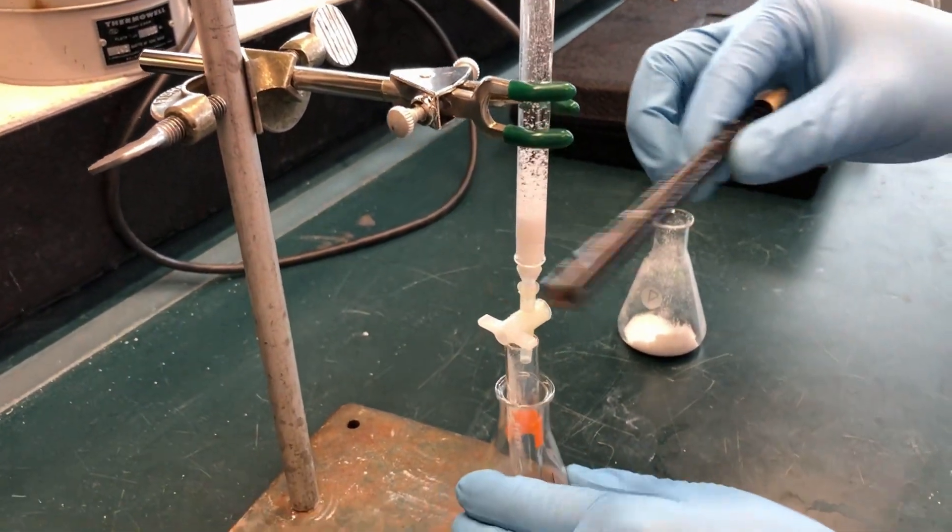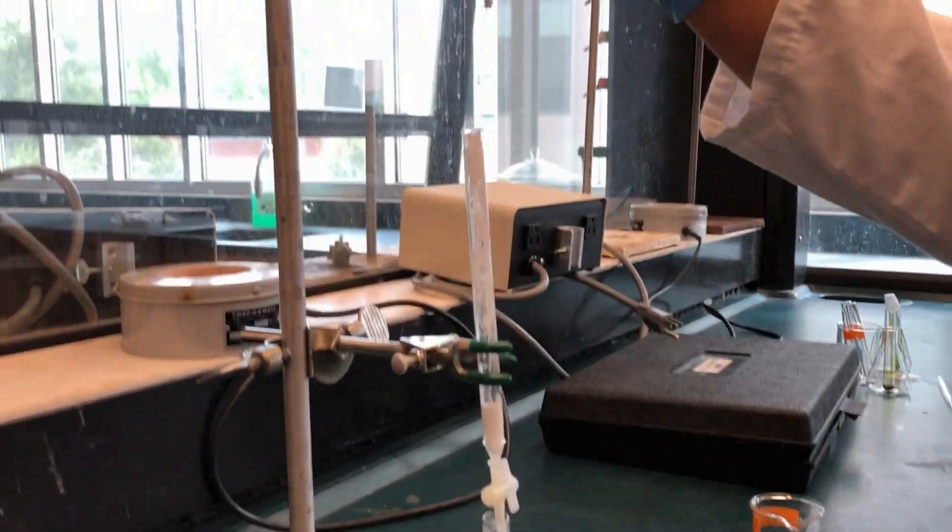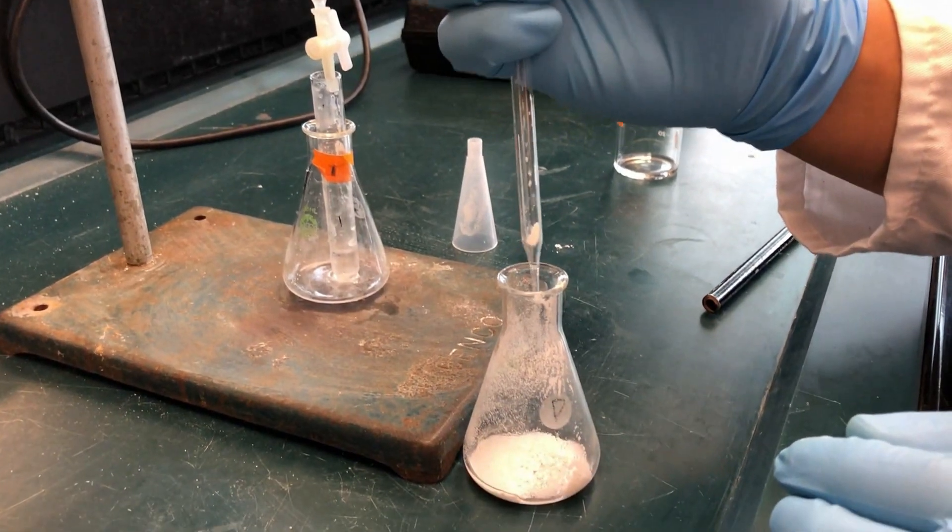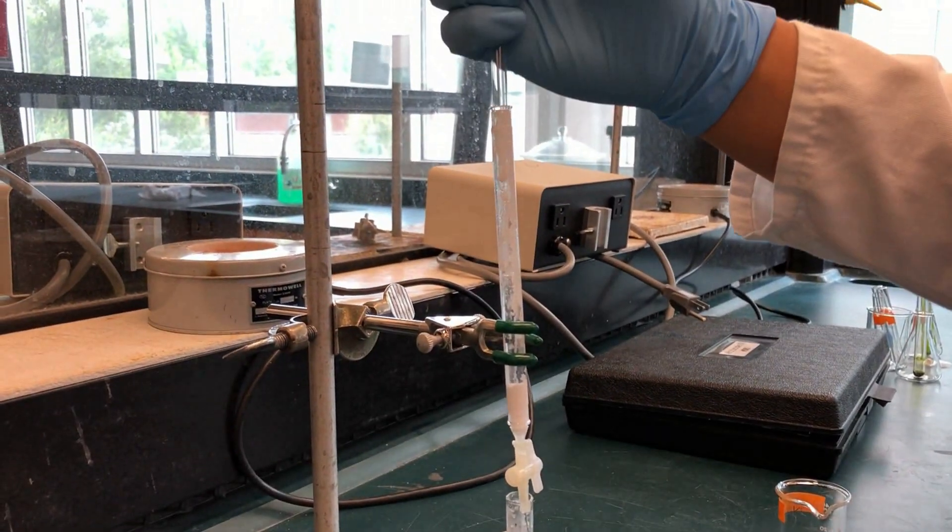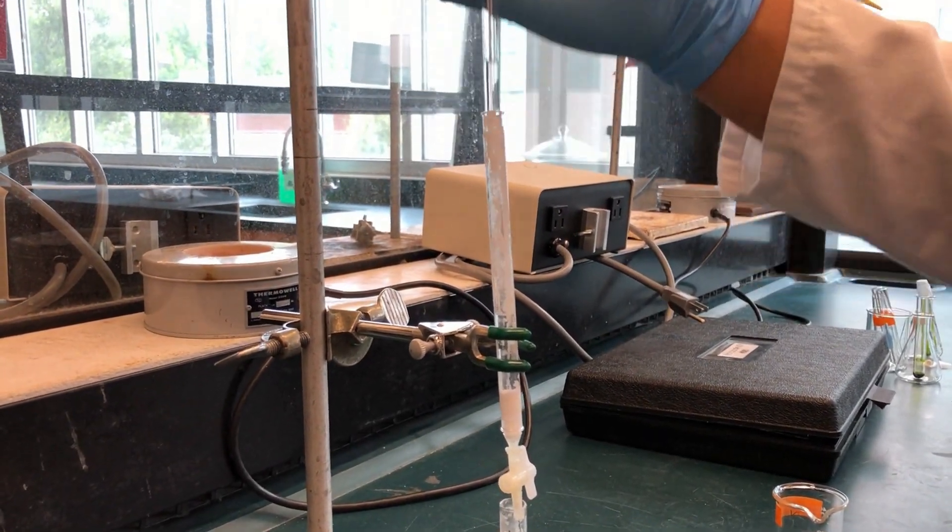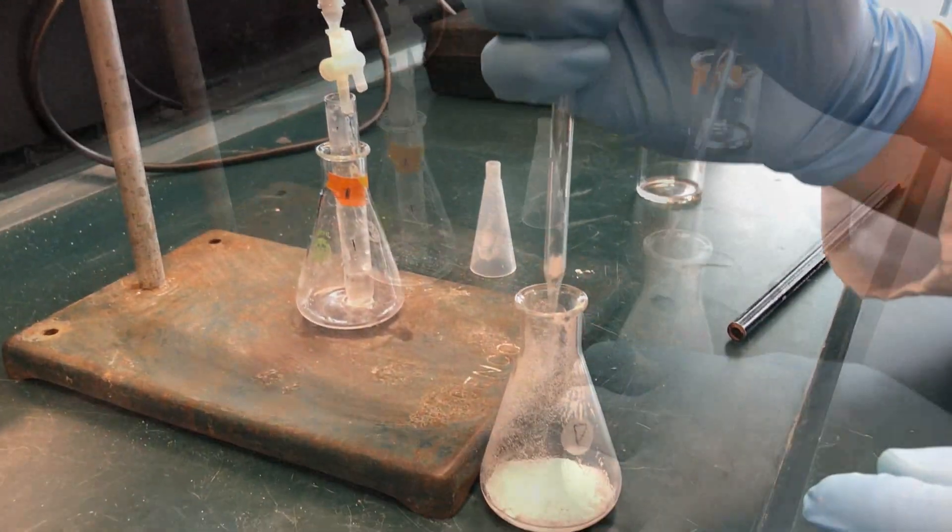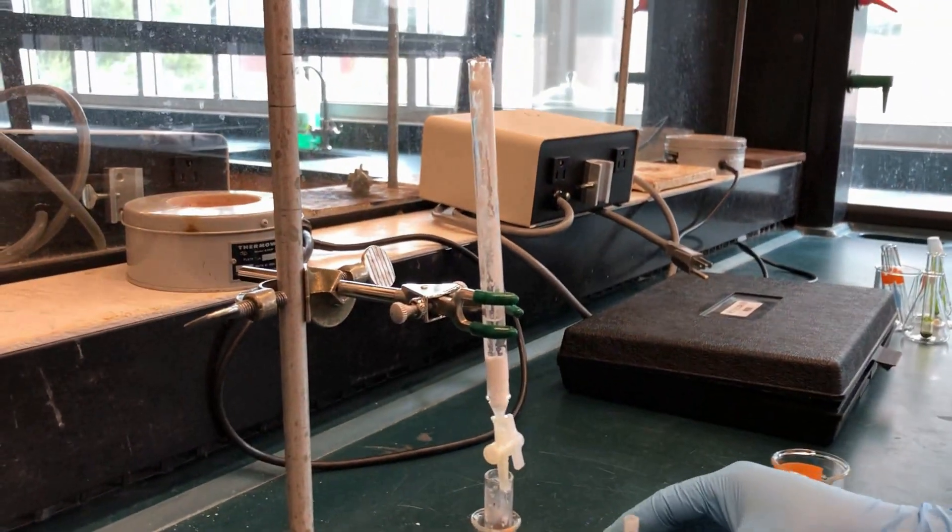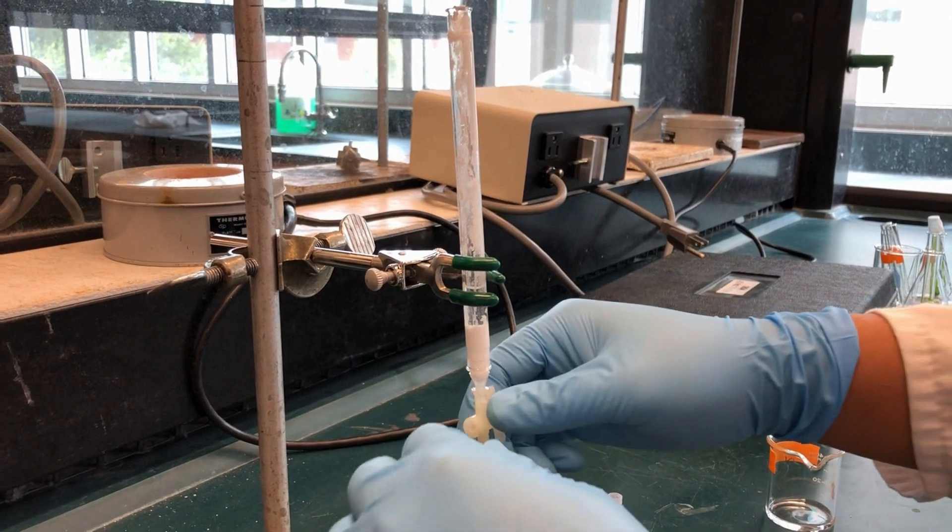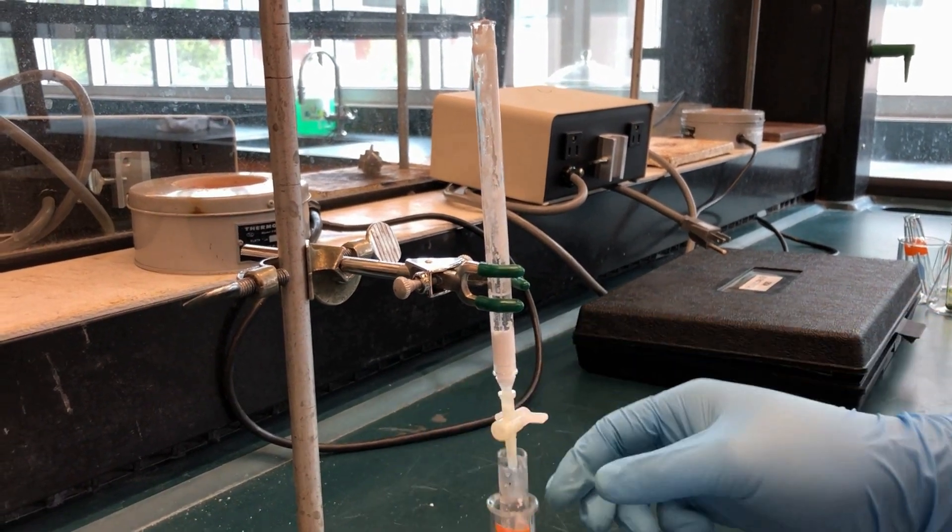Lightly tap the column with a pencil to help the alumina settle and avoid cracking. If the collection is slow, you can pipette the excess petroleum ether from the column to be reused to mix the alumina in the flask. Be careful not to pipette the settled alumina. Repeat this process until there is about 1 inch of alumina.